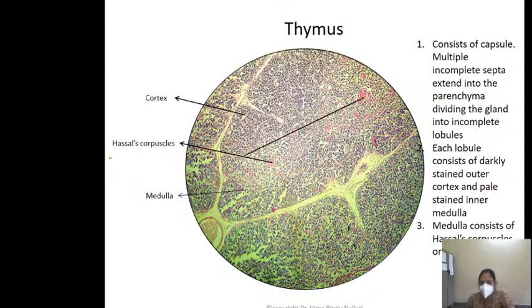For the thymus slide, you don't see lymphoid follicles. You identify it as lymphoid tissue because you see numerous lymphocytes; the entire slide is full of lymphocytes. When you see numerous lymphocytes but no formation of lymphoid follicles, you can identify it as the thymus. It's a very easy slide to identify, but in examination, many students fail to identify the thymus.